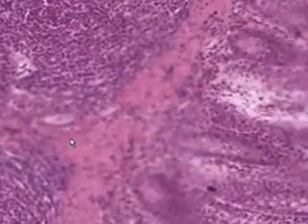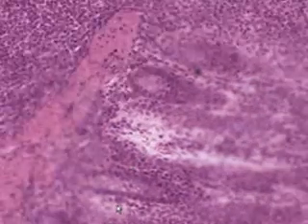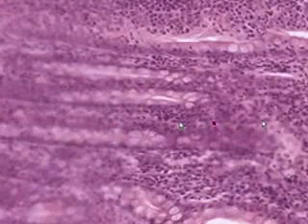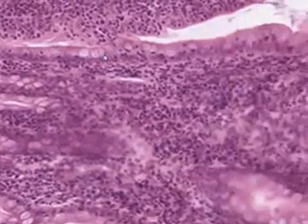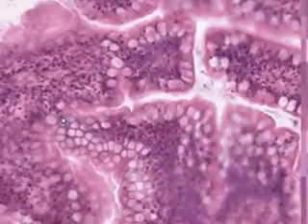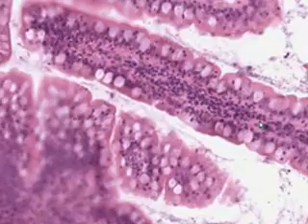This is the mucosa now, because you could see the glands, you could see the lamina propria. You may see a few smooth muscle bundles of the muscularis mucosae. And last but not least, we're still in the mucosa. We could see goblet cells, we could see absorptive cells, and we could see at the very surface these nice, perfect little villi.